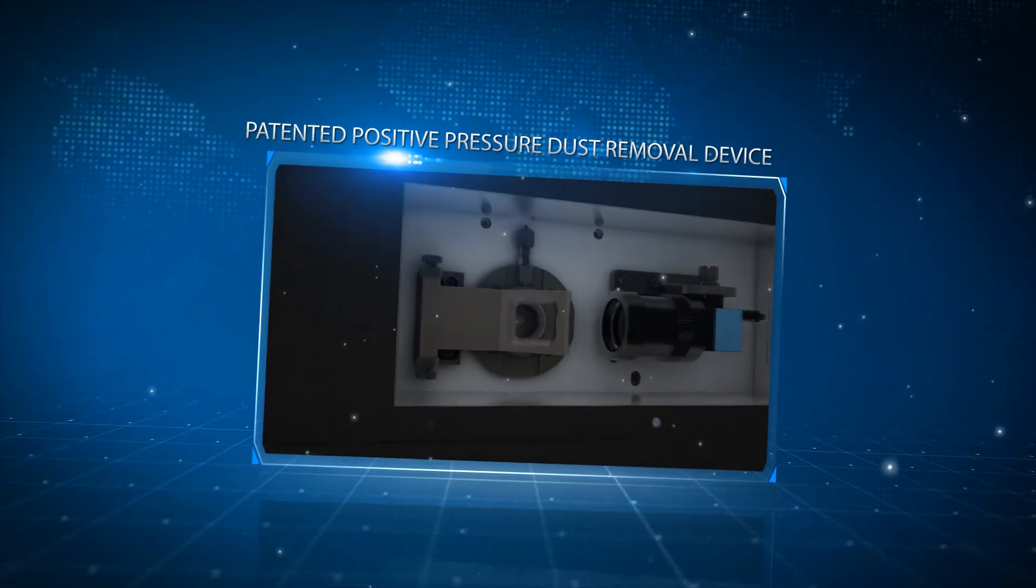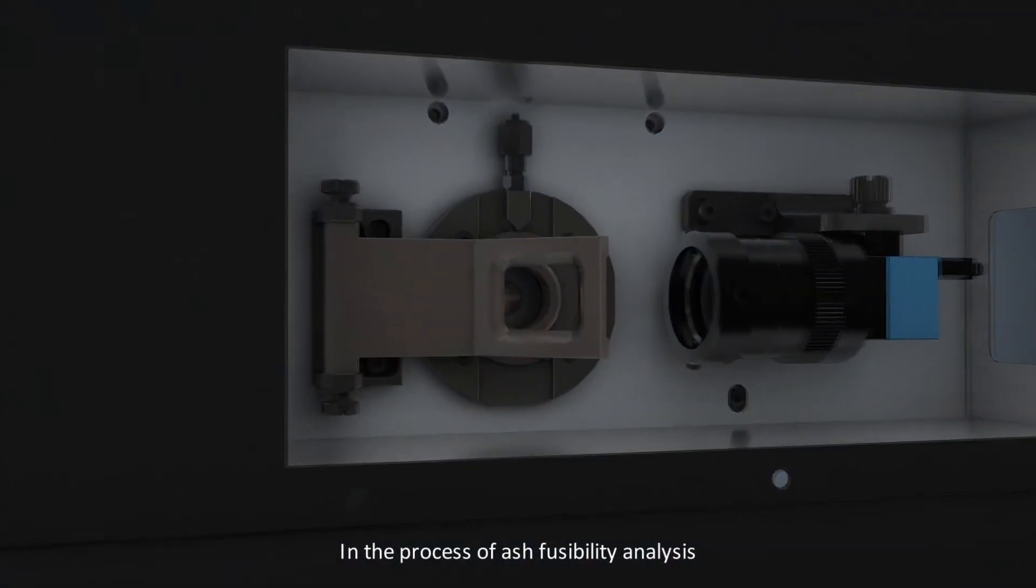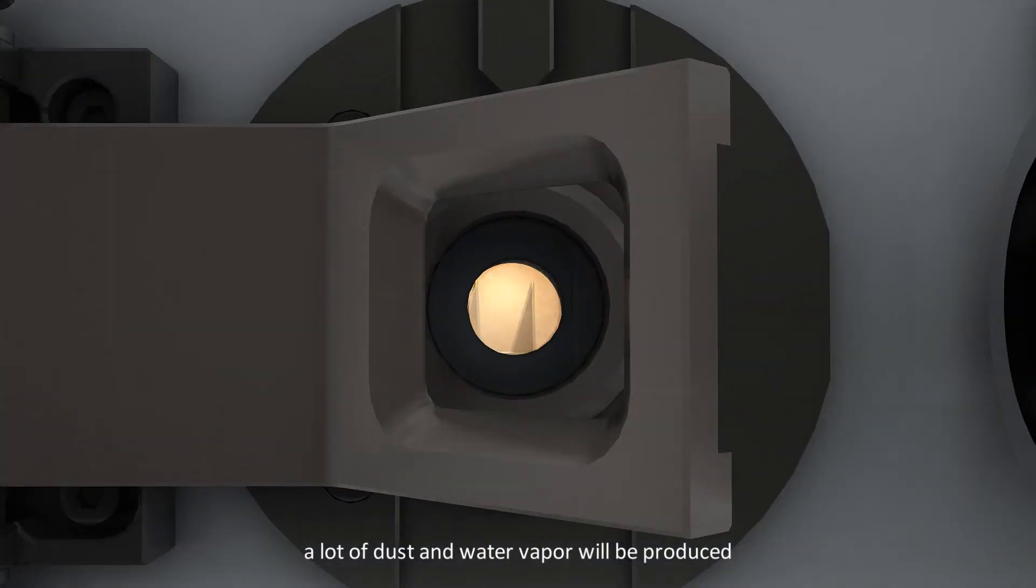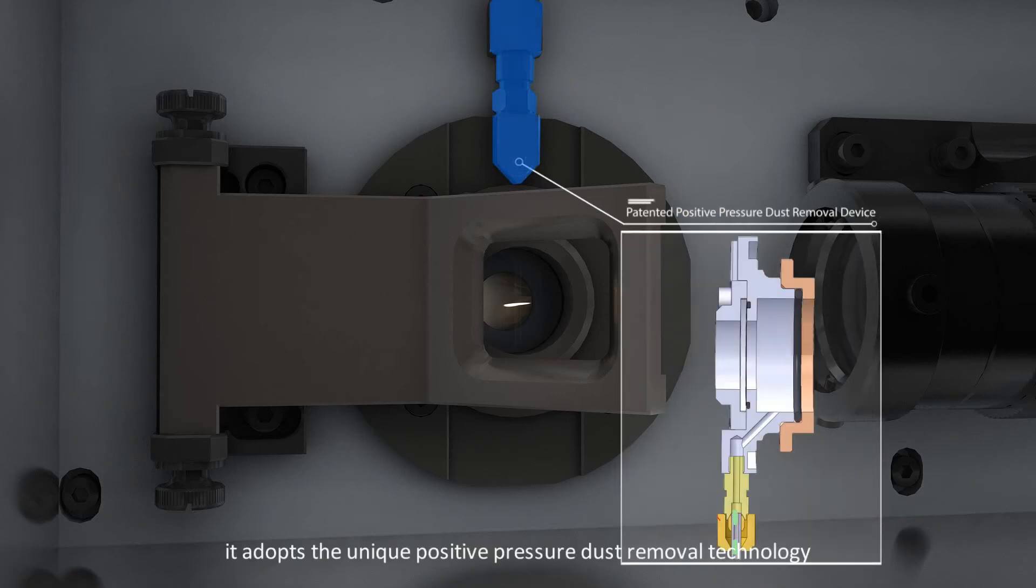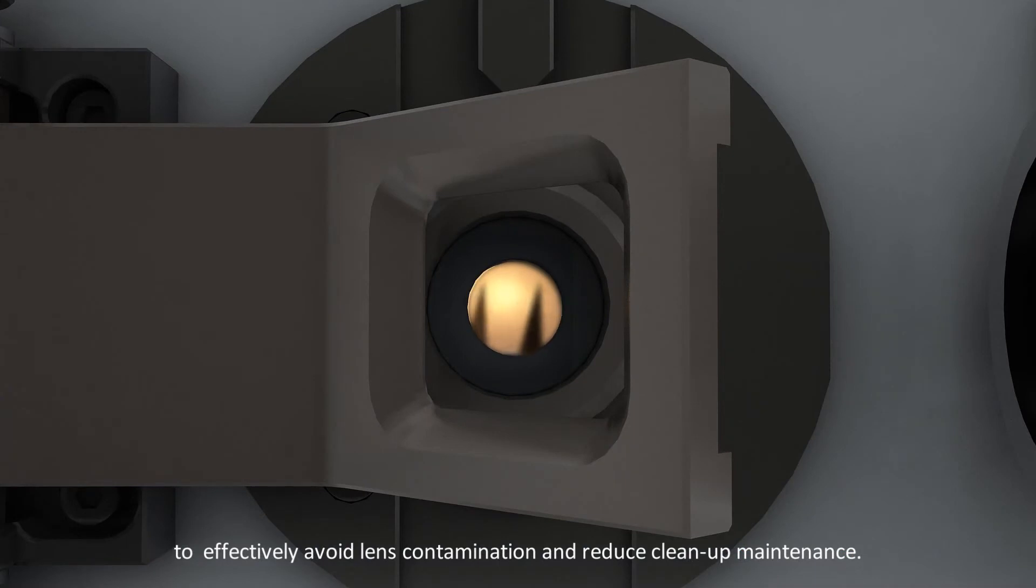Patented Positive Pressure Dust Removal Device: In the process of ash fusibility analysis, a lot of dust and water vapor are produced, which can contaminate the observing lens. Traditional instruments require the lens to be cleaned before analysis, while the 5E AF4115 adopts unique positive pressure dust removal technology to effectively avoid lens contamination and reduce cleanup maintenance.